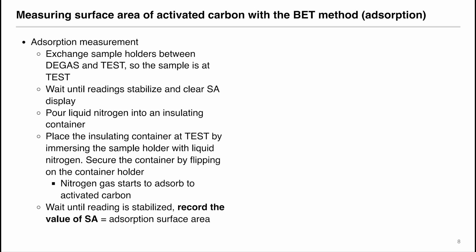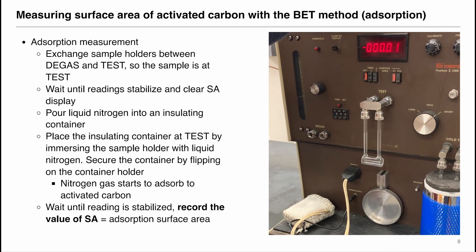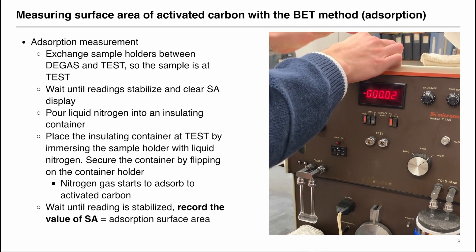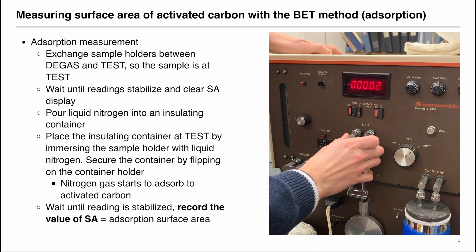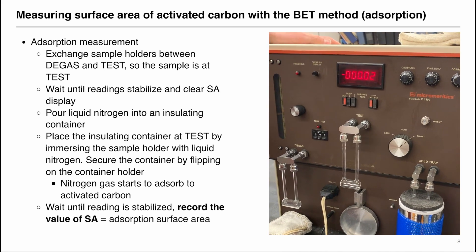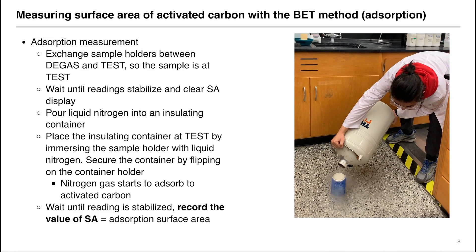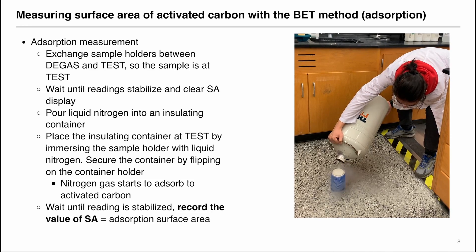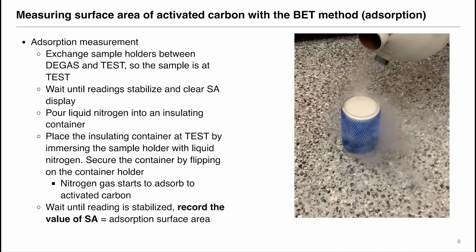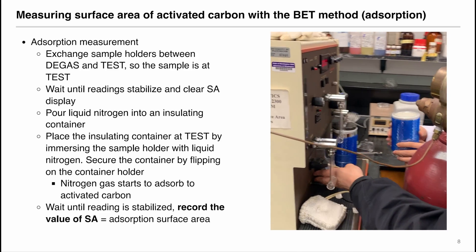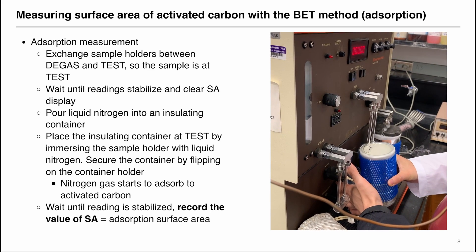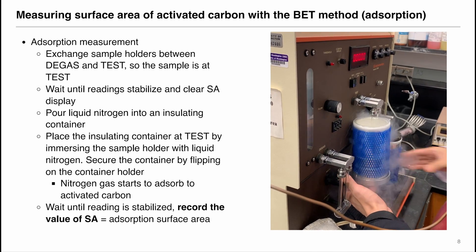After calibration, we are ready to make adsorption measurements. Start by exchanging the sample holders between degas and the test position so that the sample is at the test position. Wait until the reading is stabilized and then clear the SA display. And pour some liquid nitrogen into an insulating container that was set aside so that the nitrogen is deep enough to submerge the sample holder. And place the insulating container at the test position by submerging the sample holder with the liquid nitrogen. And secure the container by flipping on the container holder.